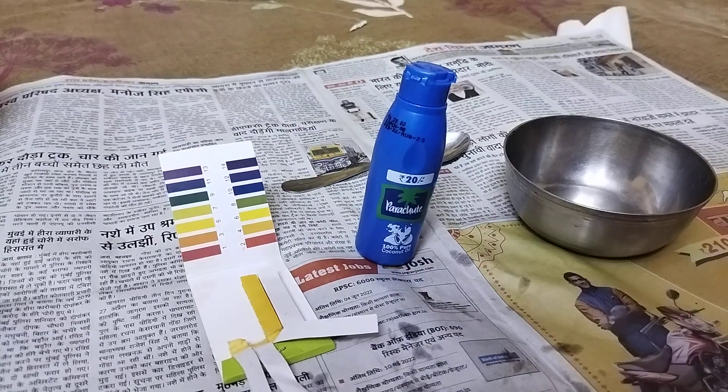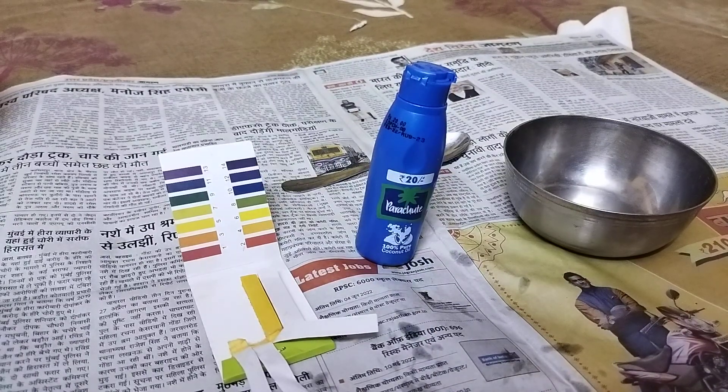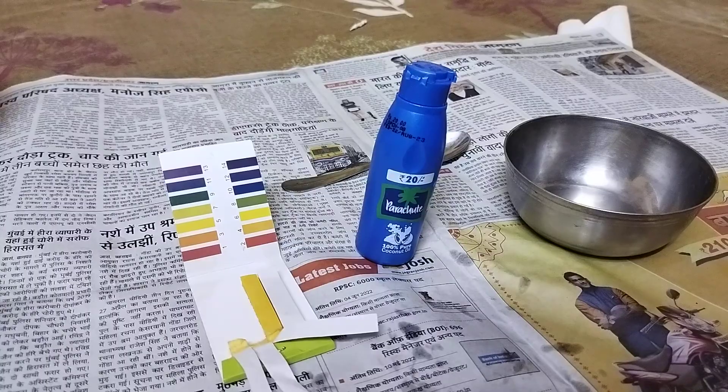Hello and welcome to my YouTube channel. In this video I'm going to measure the pH of Parachute coconut oil, that is 100% pure coconut oil.